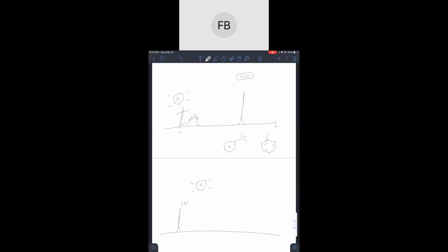See, there can't be a hydrogen there. That's no hydrogens. I'm so sorry, guys. Singlet stands for 0 hydrogens. It's weird, I did this a year ago, but it's very rusty. Does that make sense? Does everyone see how that has 0 hydrogens on it?